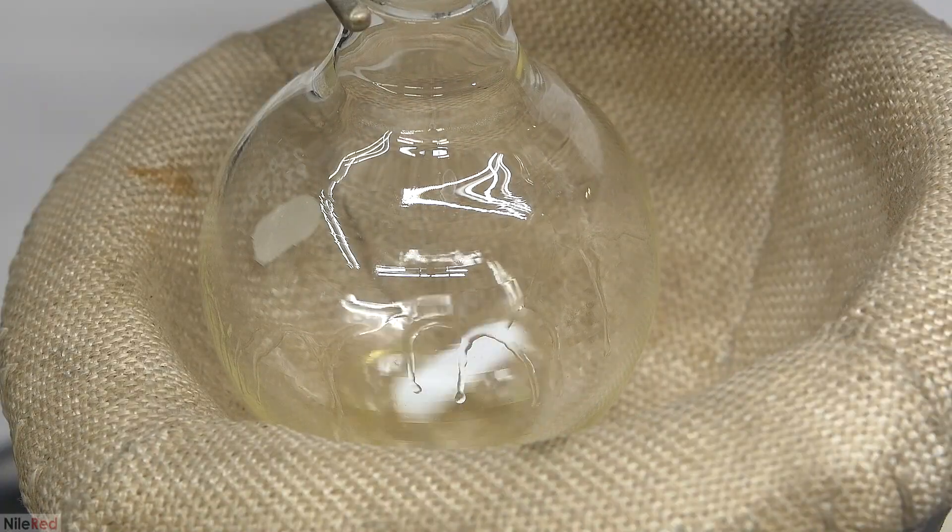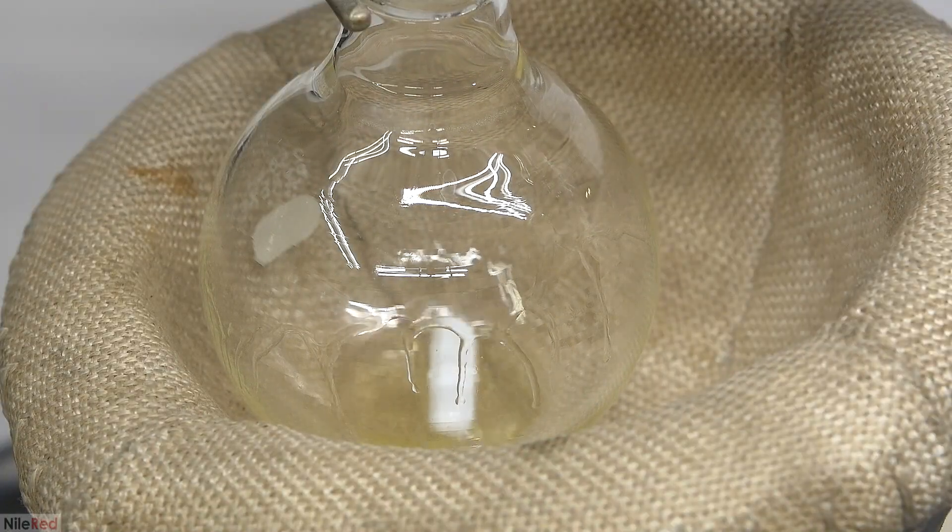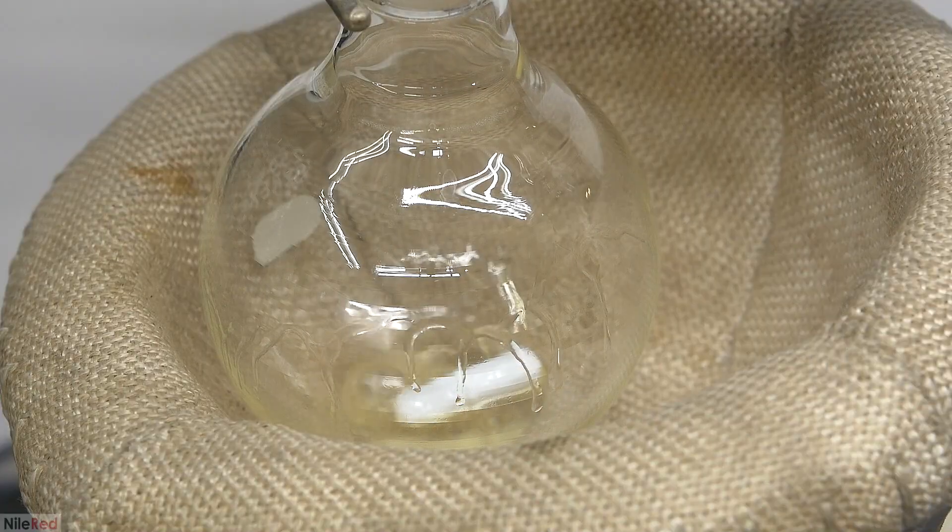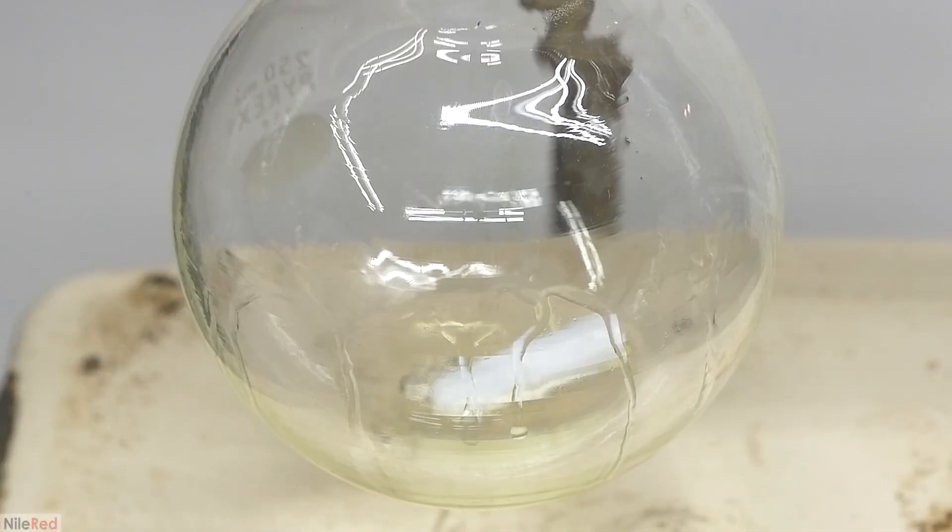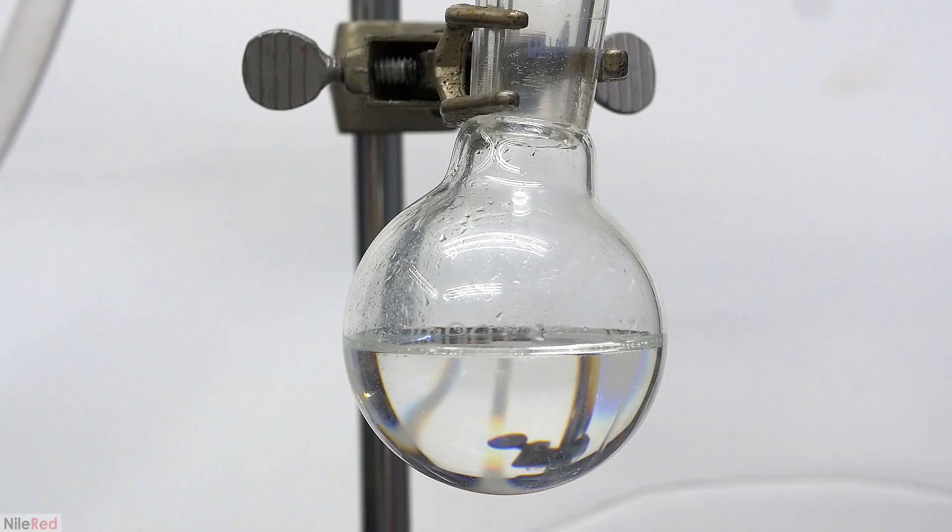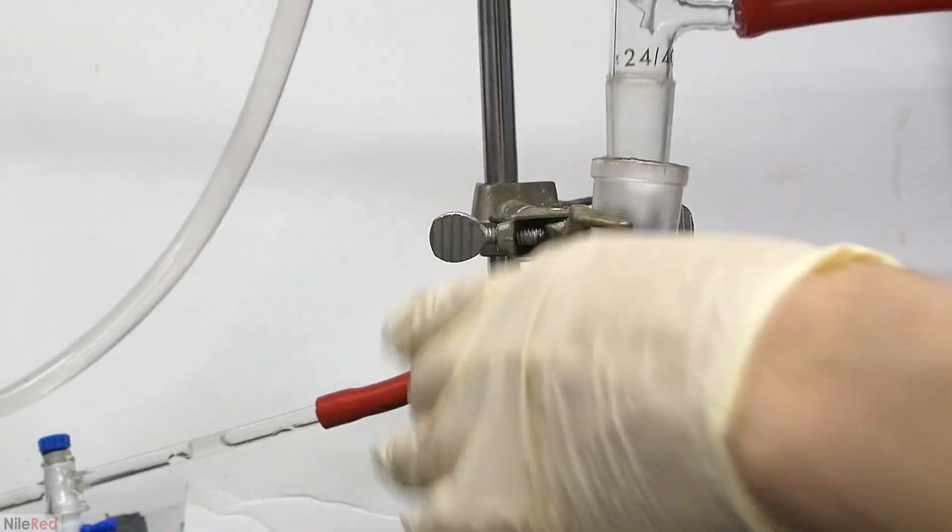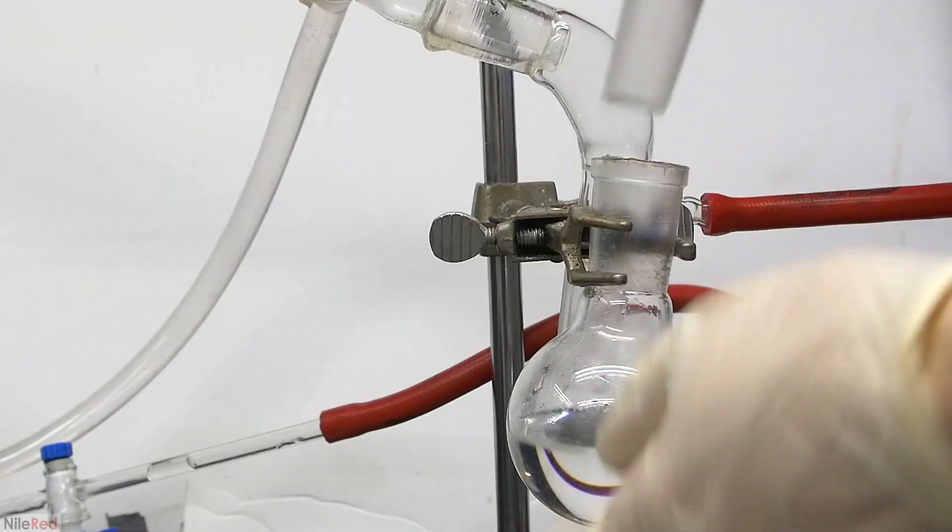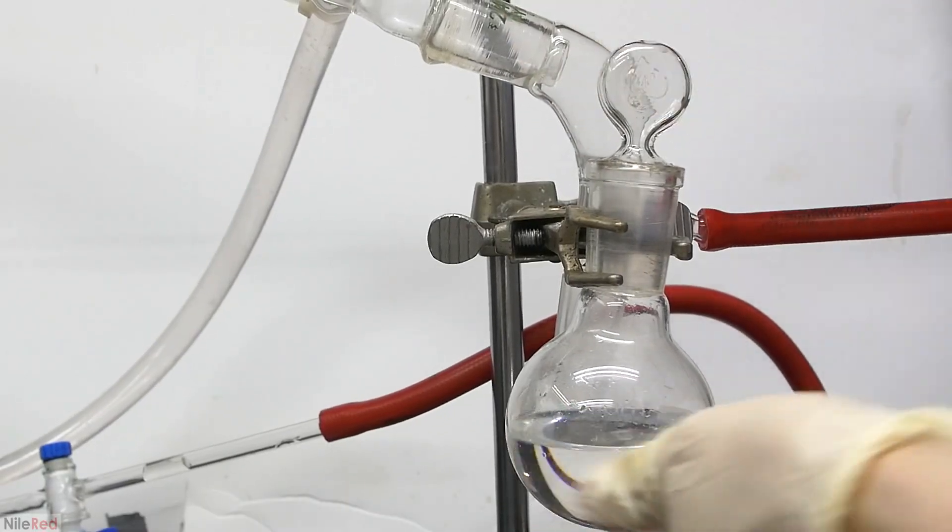Anyway, we keep the distillation going until there's only a very small amount left in the distillation flask. What we're left with is a small amount of yellow residue that crystallizes upon cooling. In our receiving flask, we have some nice crystal clear benzaldehyde. I turn off the vacuum pump, repressurize the system, and I seal the receiving flask with a stopper.